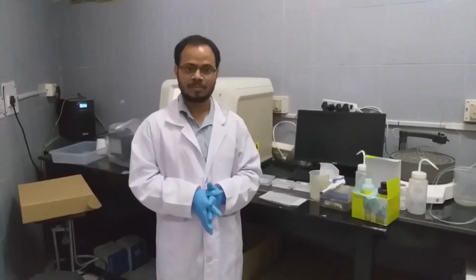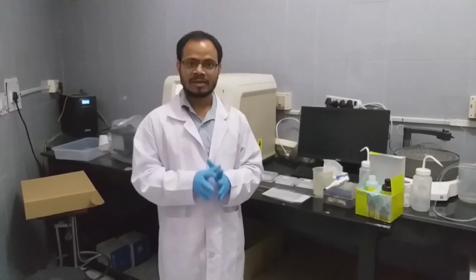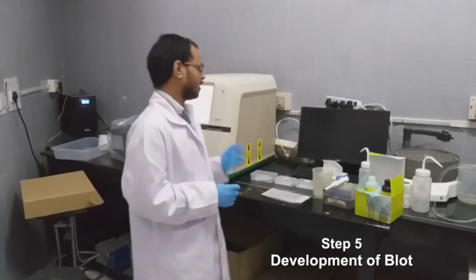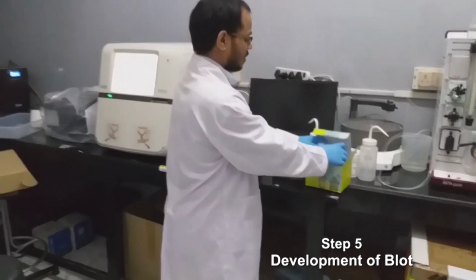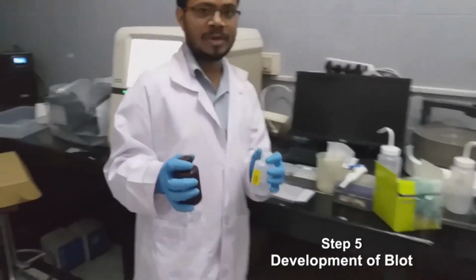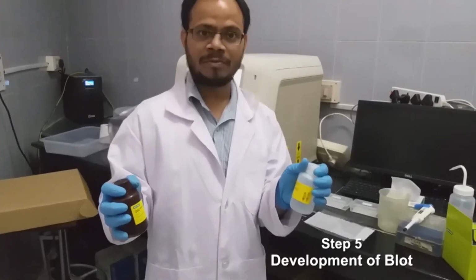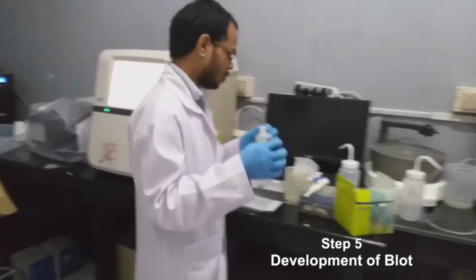This excited state product gradually loses energy by releasing luminescent photons. That light will be detected using this instrument. These are the commercially available chemiluminescent substrate solutions, available from a wide range of companies. We have to mix them in a 1:1 ratio.